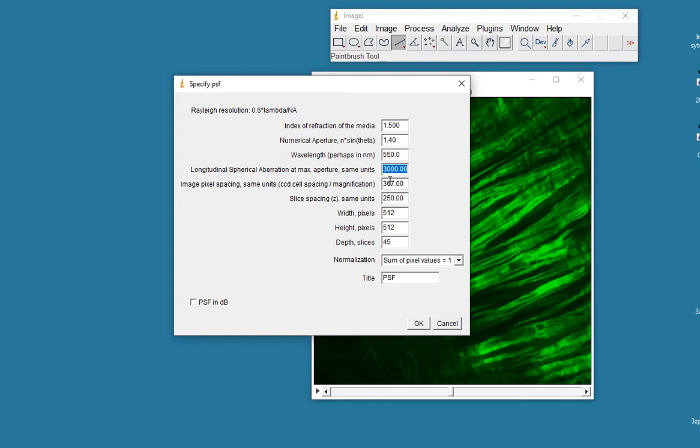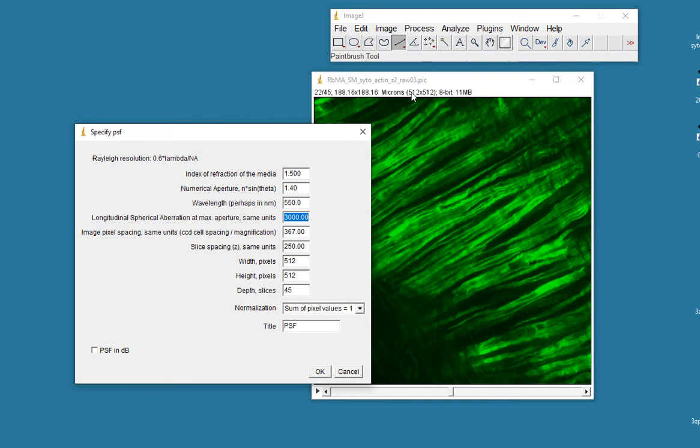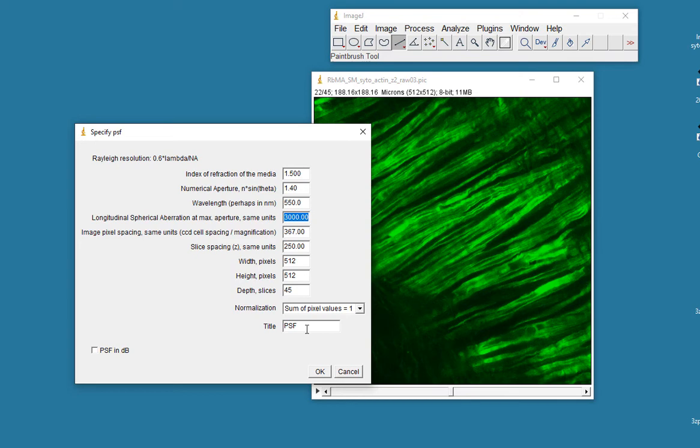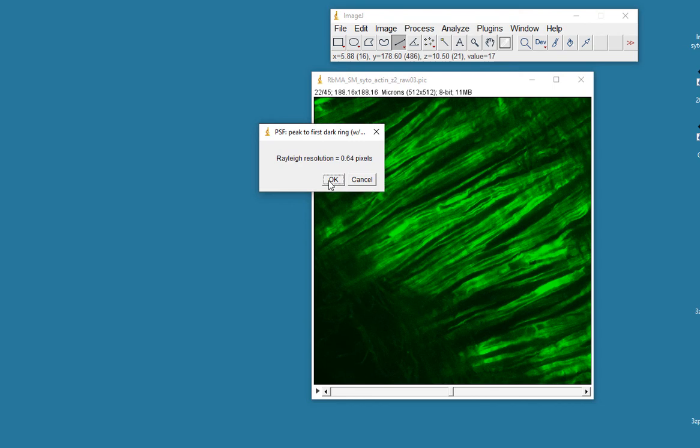This is the calibration, the spacing between pixels, or basically the size of a pixel in microns, or rather in nanometers. The spacing between the slices is 0.25 microns, 250 nanometers. The size of the image is 512x512, as we can see here, and in this particular case we're looking at image 22 of 45, so there are 45 slices. We'll call this volume point spread function, and we'll click OK.